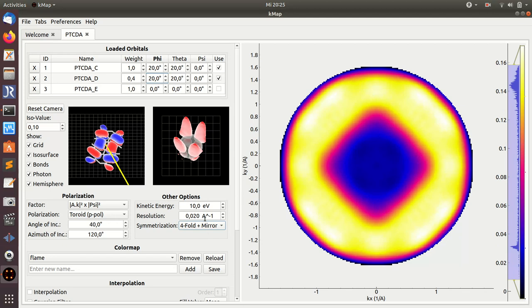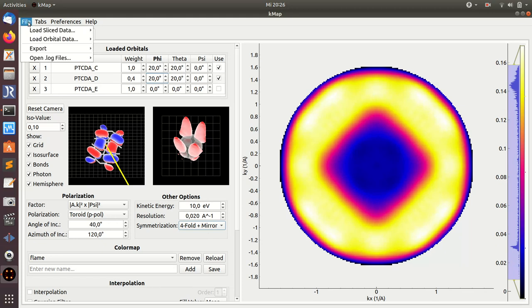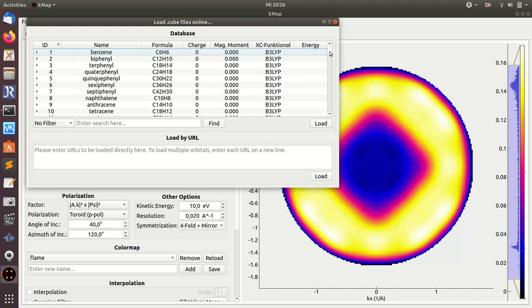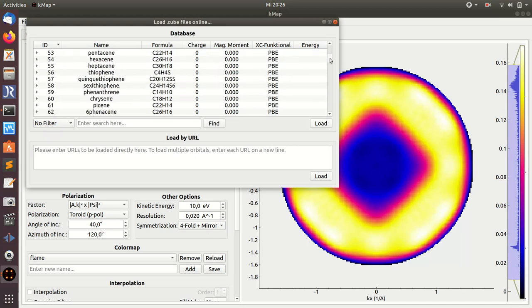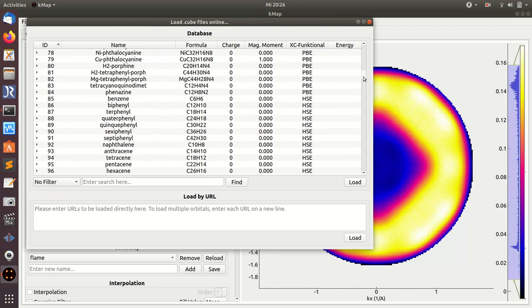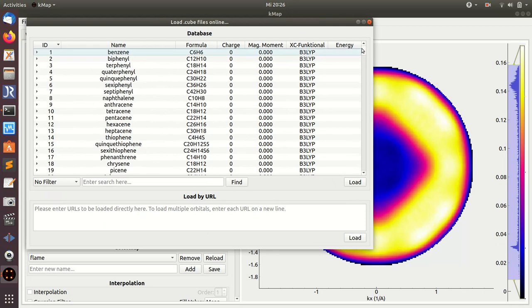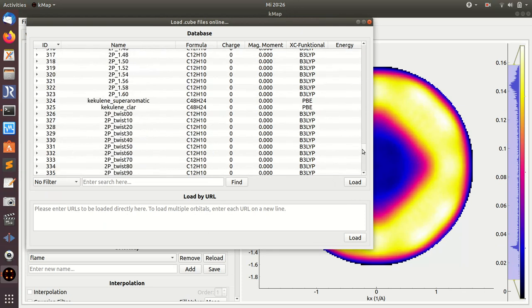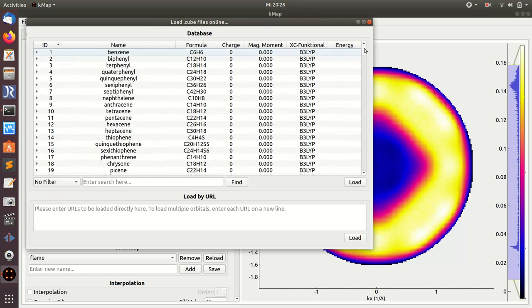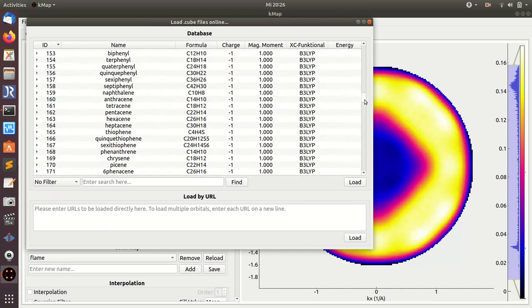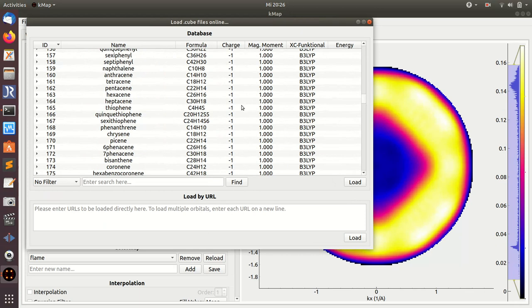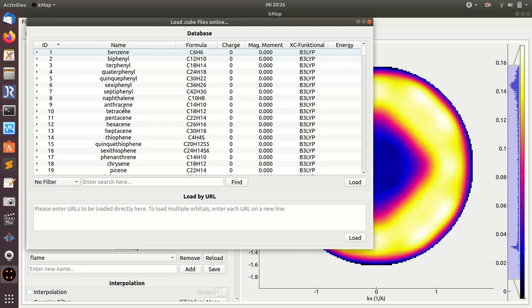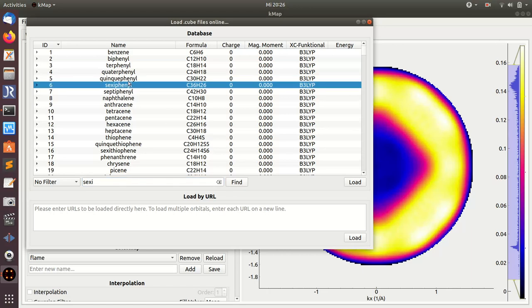In the beginning I mentioned that there are two ways to load orbitals. One is to use local cube files. You can also load orbitals from an online database. Go to load orbital data online, and then you get here all molecular orbitals that are in the online database. For instance, if we want to load a certain molecule, for instance I want to have sexiphenyl, then you can find it here.